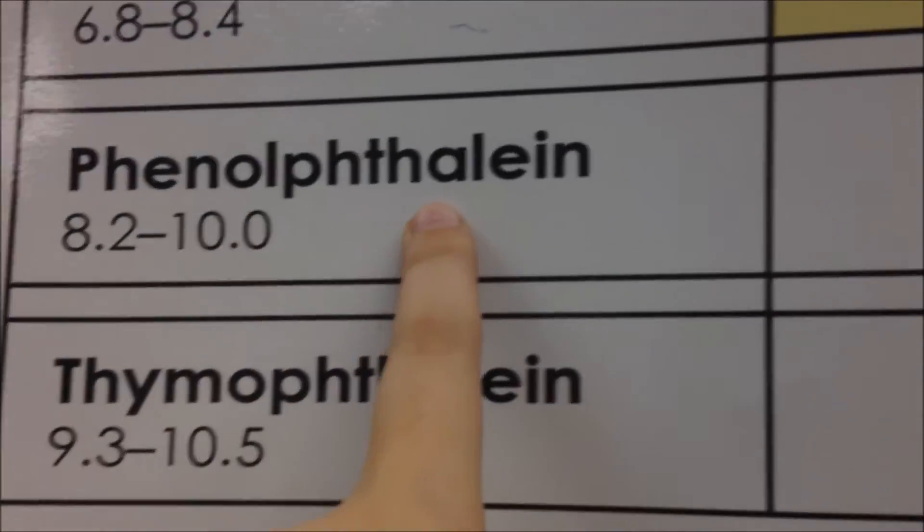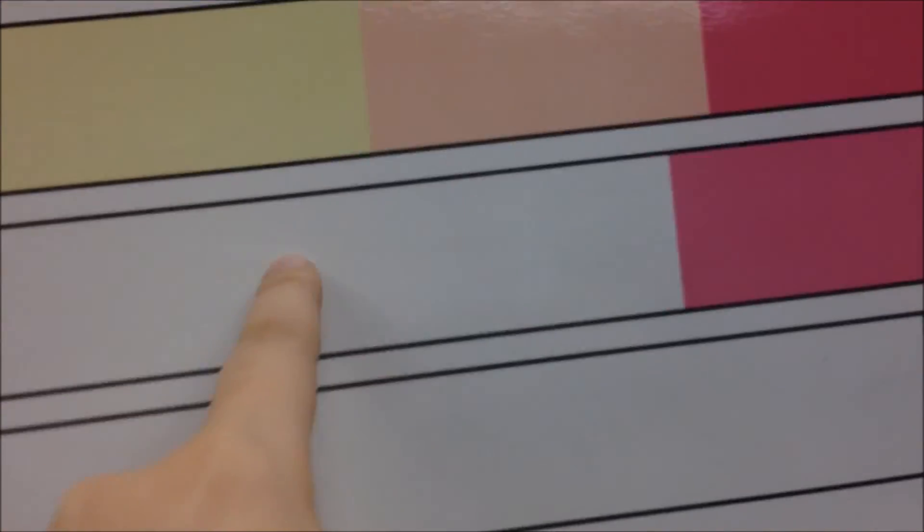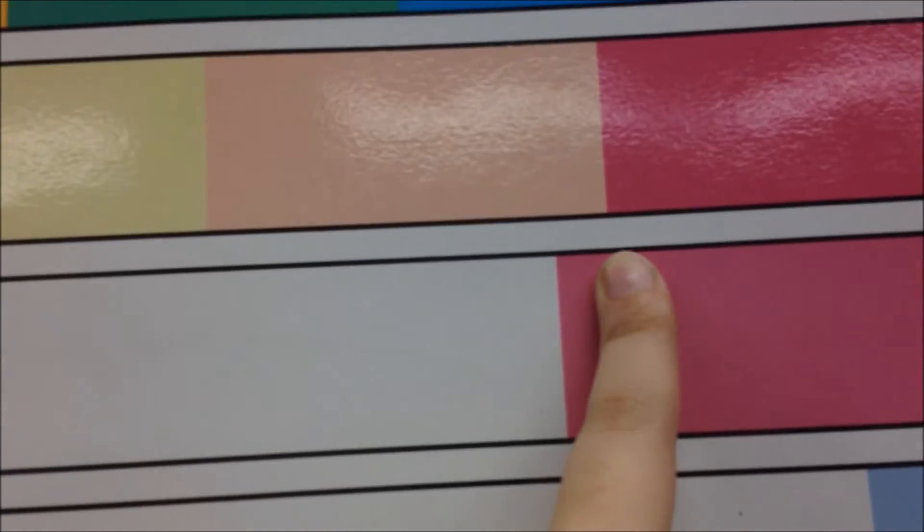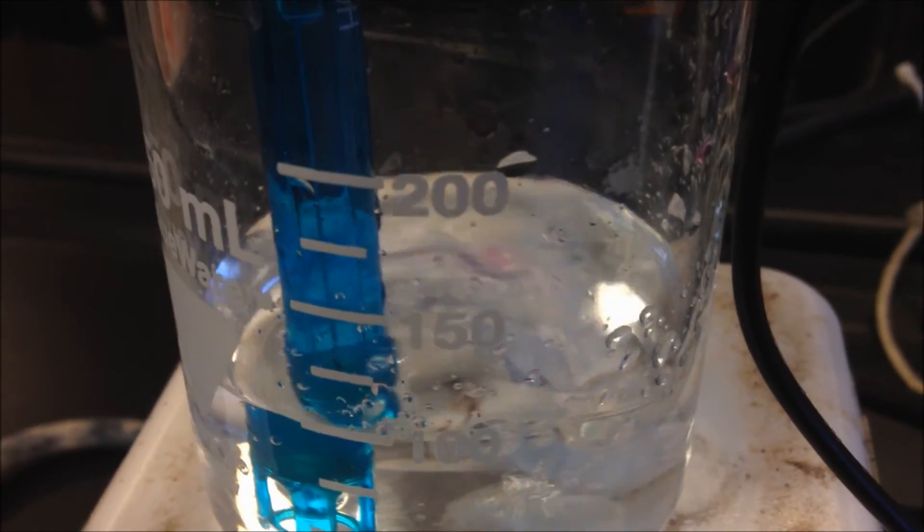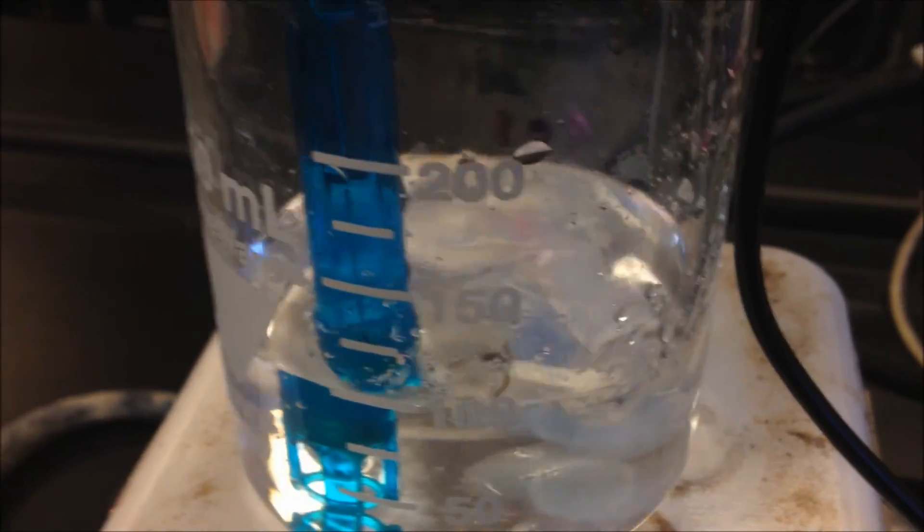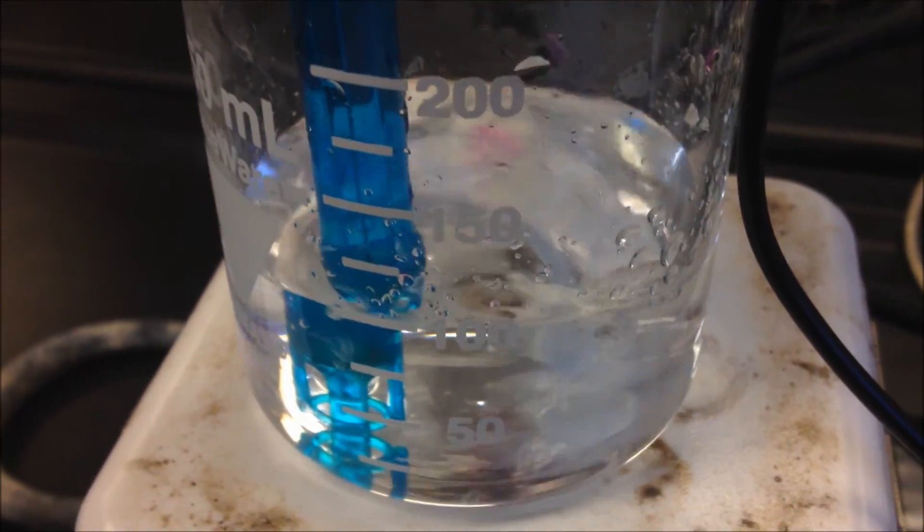This is our phenolphthalein, and that's our indicator. At about 8 it will turn pink. There's some pink coming in. Hints of pink. Two drops of pink. Slightly rising, still in buffer.